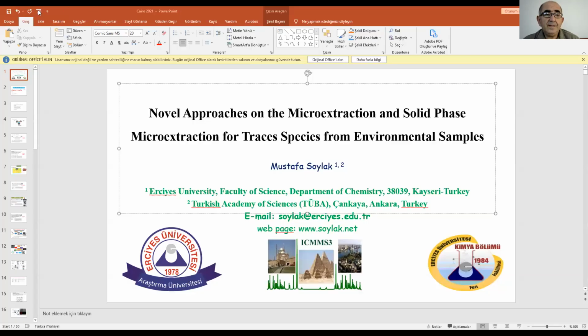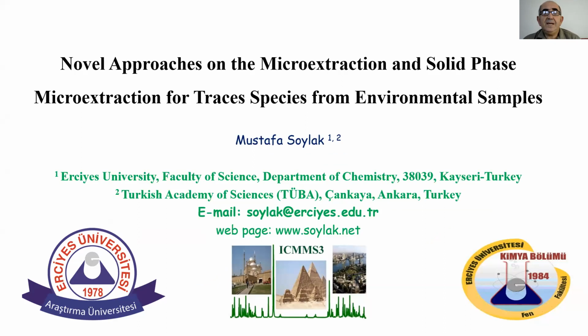I'm working on separation and preconcentration of trace metal ions and trace organic pollutants from environmental samples. We are using preconcentration and separation techniques, and nowadays especially microextraction studies. In my presentation, the title is a novel approach on the microextraction and solid phase microextraction for trace species from environmental samples.